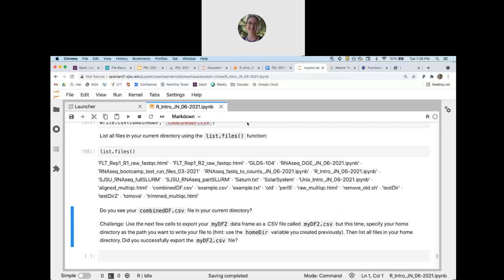Okay, go ahead and put your code in the chat.